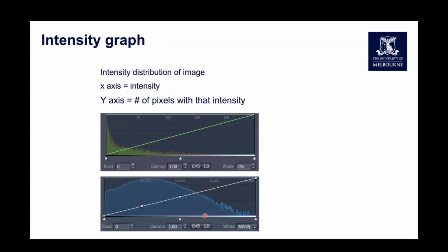Next, we'll go through image acquisition and how to set up the microscope to take a good quality microscope image. Often one of the things we look at first here is something called the intensity graph. I've shown a couple of examples of this here.